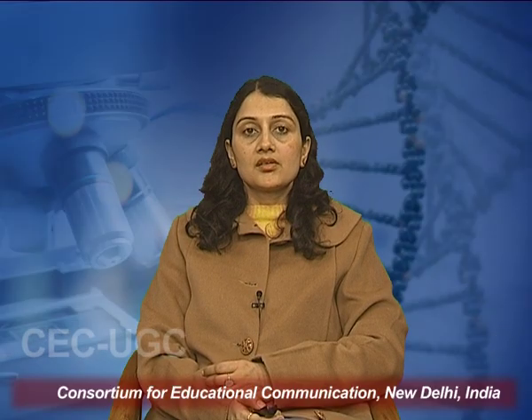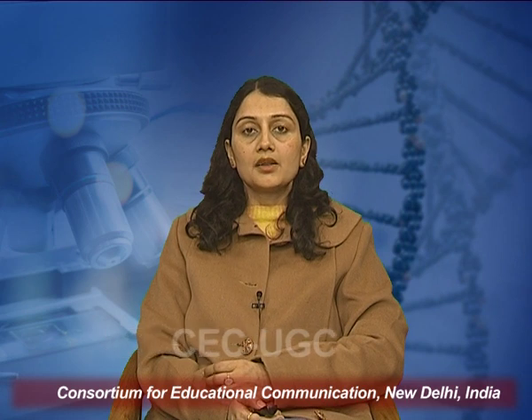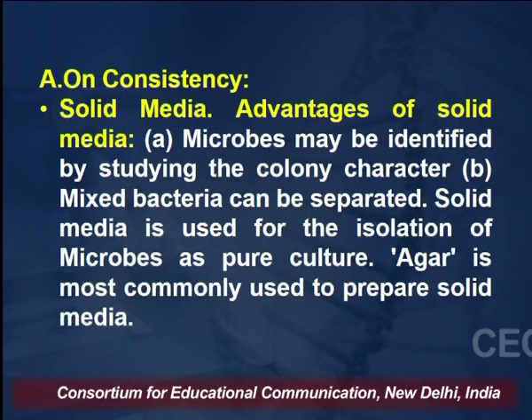Let's move on to the first type, that is based upon the consistency. So, solid media are the media which are solid. Advantages of using solid media is that microbes may be identified by studying the colony. The mixed bacteria can be separated and pure colonies can be obtained. Solid media is used for the isolation of the microbe for the pure culture.